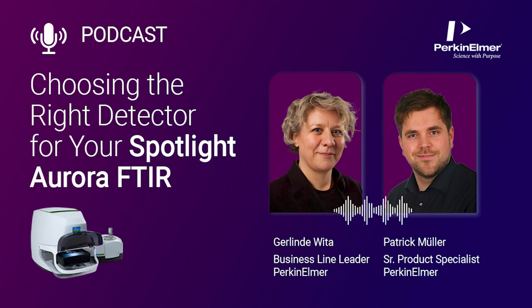Thanks a lot, Patrick. And can you please explain which factors influence the choice of the detector? Yeah, of course. So the first thing you always have to think about is what samples you want to measure, because this directly relates to the choice of detector. And there's two main factors. One is the size of the samples, and the other one is the spectral range that is required for your sample measurements. And both of these influence the detector choice.